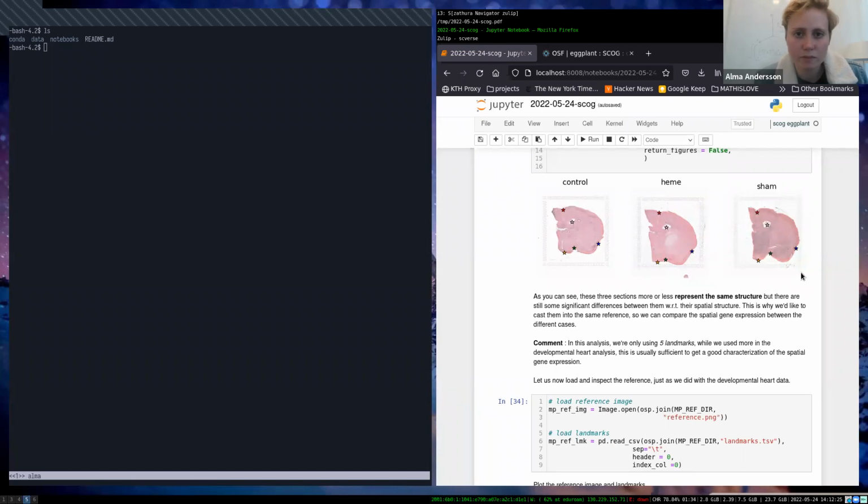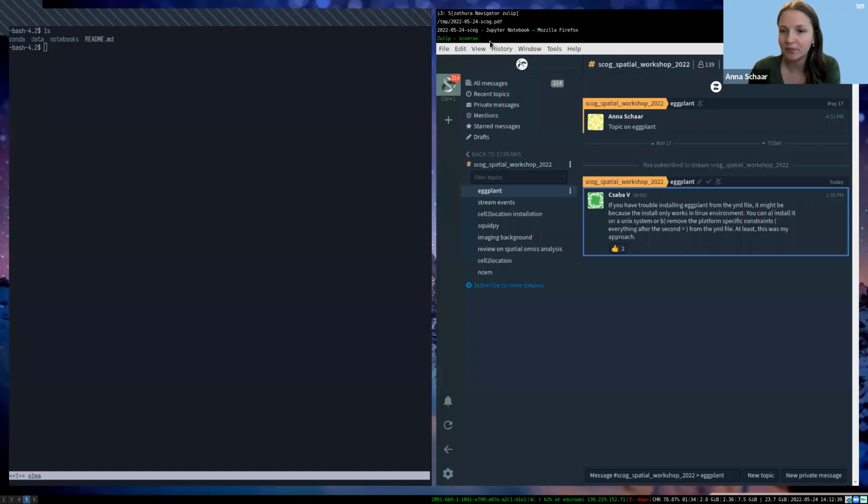Yes. And I think we have one more comment and one question in the chat. The question in the chat would be, if you have a recommendation, how the reference should be selected and how it is actually selected.